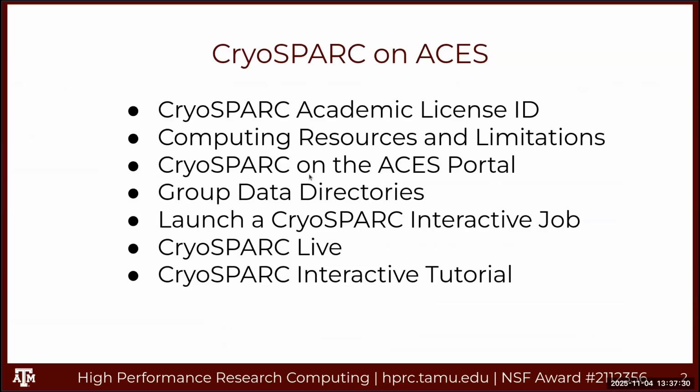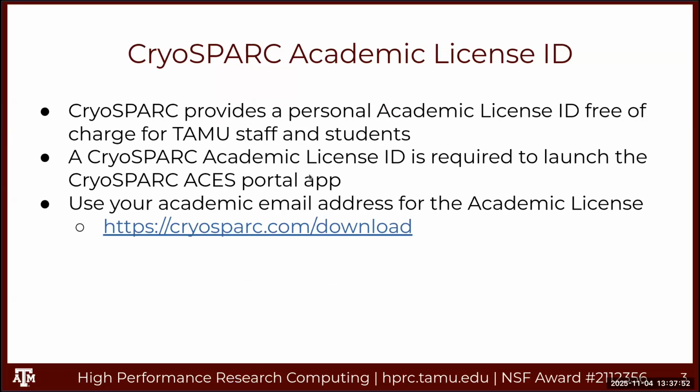All right. So I'll cover how to get started. You'll need an academic license ID, which you can get free from CryoSPARC. We'll go over the computing resources, logging into the ACES portal and starting a CryoSPARC job. Then we'll talk a little bit about CryoSPARC Live, and then most of this course will be the interactive tutorial.